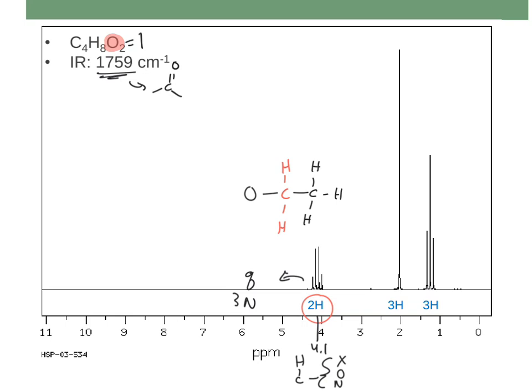So just from this signal here, this 2H quartet at 4.1-ish, I'm able to build this chunk. It's an ethyl piece attached to an oxygen. I got all that information from there. I'm going to continue to this 3H peak. So I know this is a 3H. So I'm going to draw the 3 hydrogens on 1 carbon. They're all in the same environment.